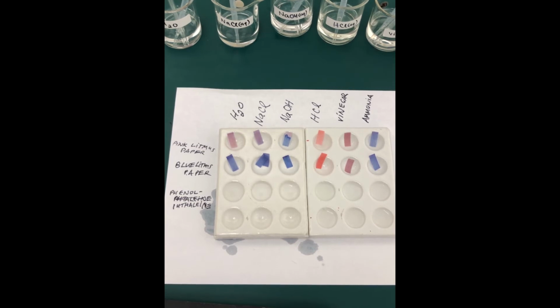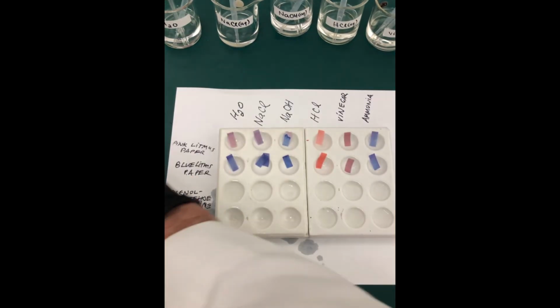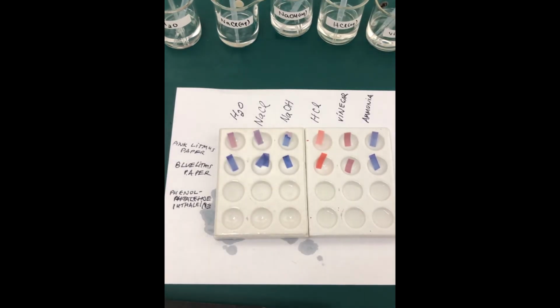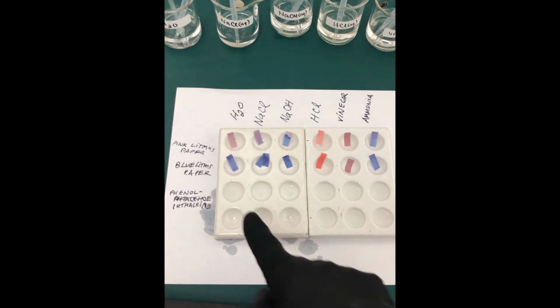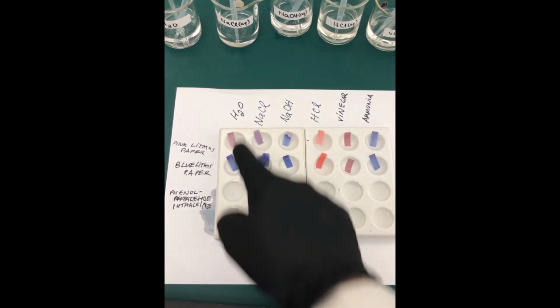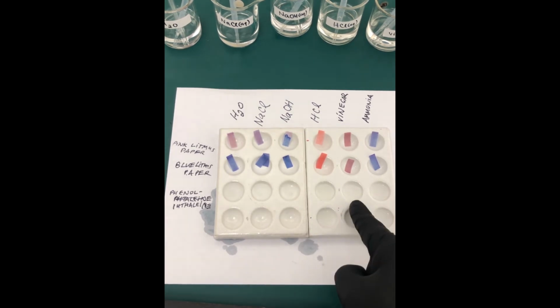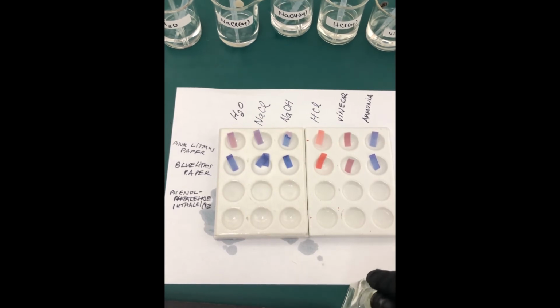Sorry, students, I had a little spill here while I was getting ready for the next step, but here we go. Our last test is going to be against phenolphthalein. Phenolphthalein is a solution of a chemical that changes color depending on whether the solution has an acid or a base in it. So what I've done is I've placed in these wells samples of water, NaCl, NaOH, HCl, vinegar, and ammonia. And what I'm going to do is simply put a drop of phenolphthalein into each one.